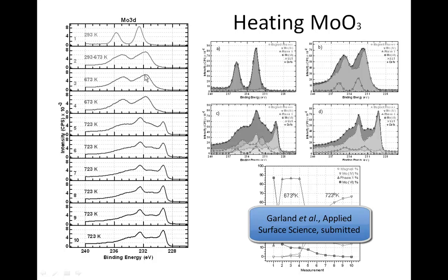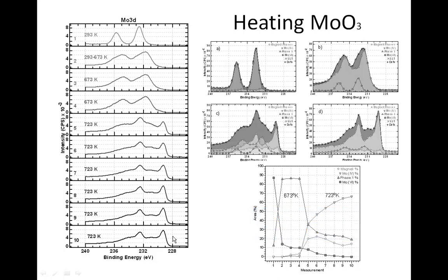And the idea is that we started with molybdenum trioxide and we think we're heading towards molybdenum dioxide, but how these two phases move between one and the other as a consequence of different temperatures, this has been highlighted by using this technique of calculating difference spectra and then fitting your difference spectra back to the original data. So in this case we actually have 4 different shapes. 2 of them derived from the initial modifications at a given temperature. So at 400 degrees Celsius the changes were characterized by these 2 shapes.